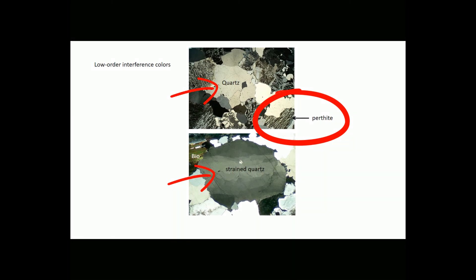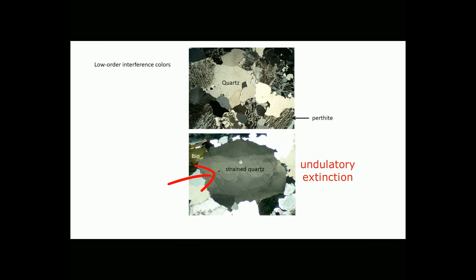Perthite displays a wormy texture due to exsolution, which produced parallel zones with slightly different optical properties. Note that the quartz grain, especially apparent in the bottom view, has patchy or blobby interference colors. This is typical for quartz and helps identify it. If you rotate the grain, different parts of the grain will go extinct at slightly different angles — this is called undulatory extinction, and quartz is one of a few minerals that show it commonly. On the left-hand side in the bottom photo, there is one flake of biotite showing higher-order, middle-order interference colors compared to the quartz and feldspars.